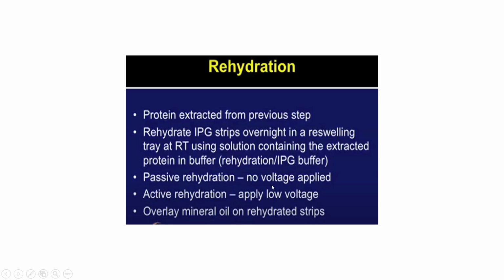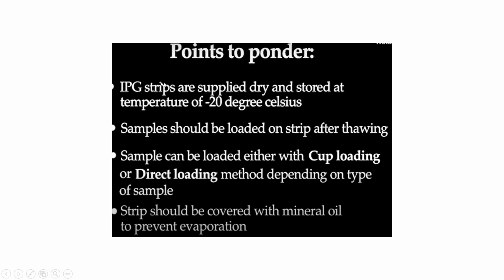Then you do passive rehydration where no voltage is applied. We do active rehydration where a low voltage is applied, and you overlay a mineral oil so that the strip gets rehydrated first, and then this is just the overall review.